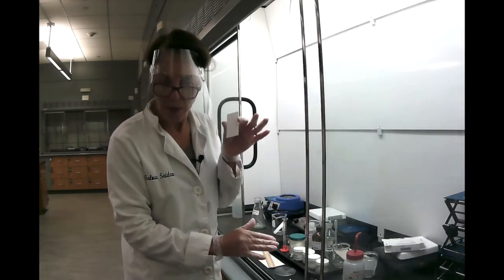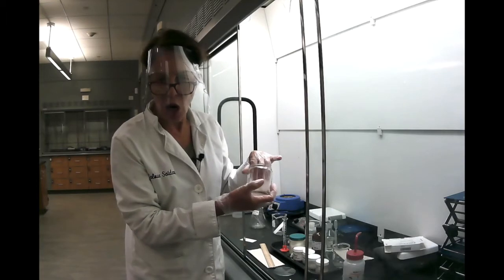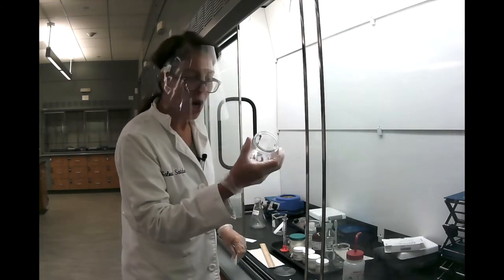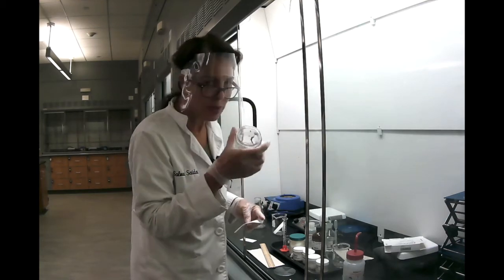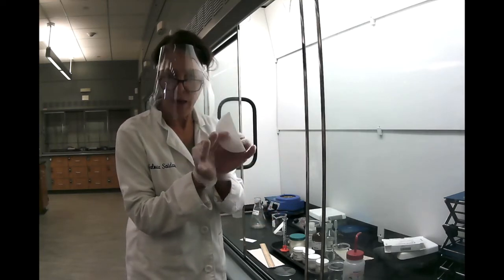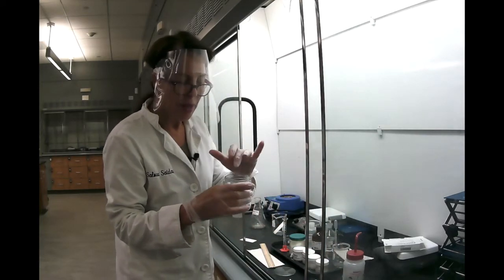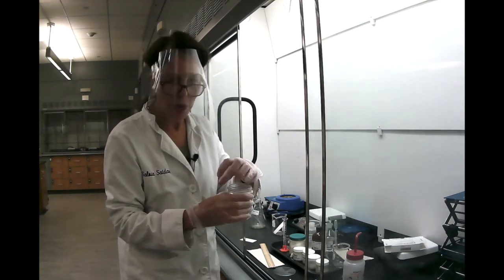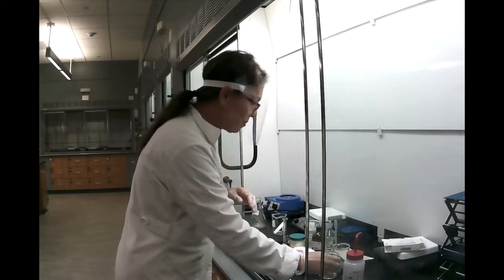But before I start spotting the substances here, I want to prepare my developing jar, because you want to saturate it with the liquid. So what goes in this jar? See, this jar has to have a cap. You really need to have a closed environment. So that's the reason we use this type of jar. You take a filter paper and you fold it in half, and then you put it in the jar just like this. Now, why the filter paper? If you read the handout, it tells you the filter paper will absorb your liquid and it will saturate this whole jar with that liquid.